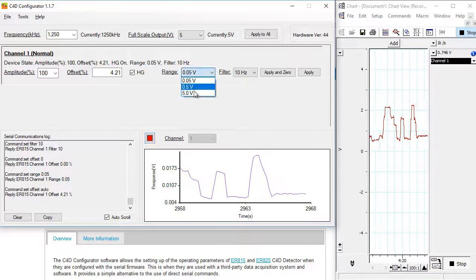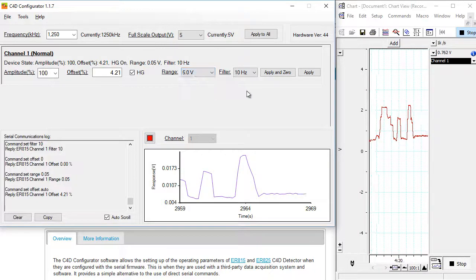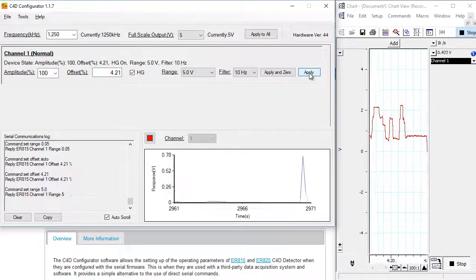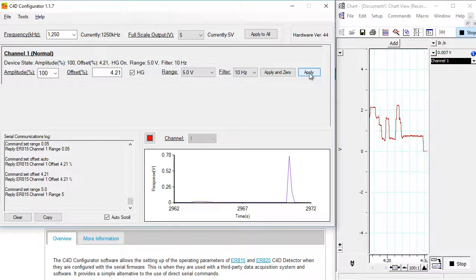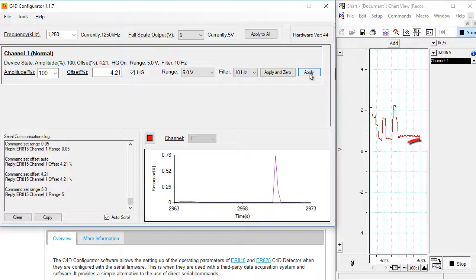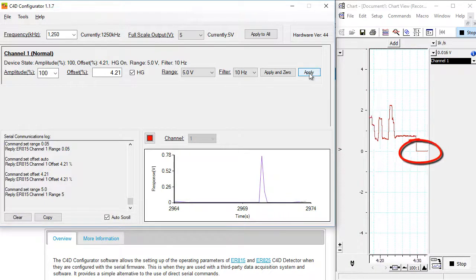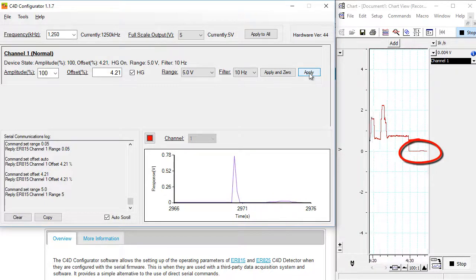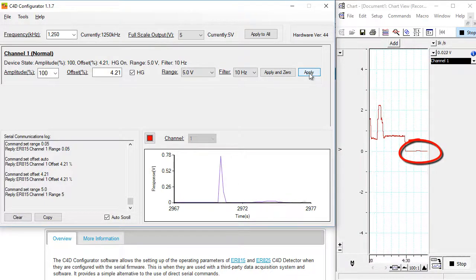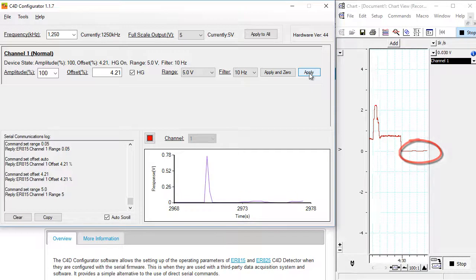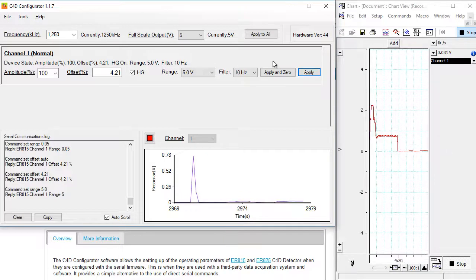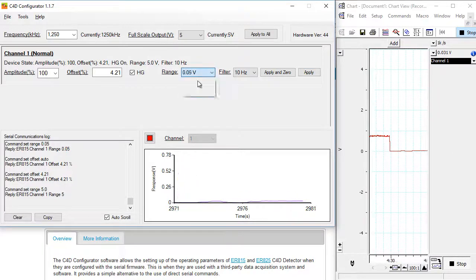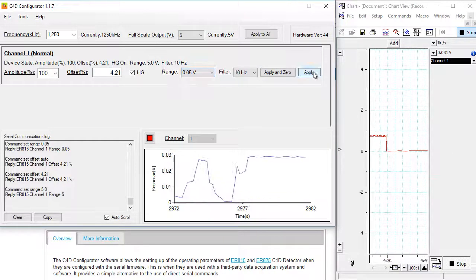If I was to set the range, say to 5 volts, and I click apply, you could see those small changes, you can hardly see. So this is why, to see the small peaks, it's important to choose a small range.